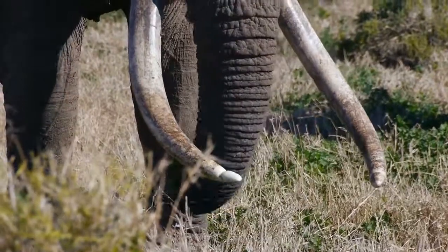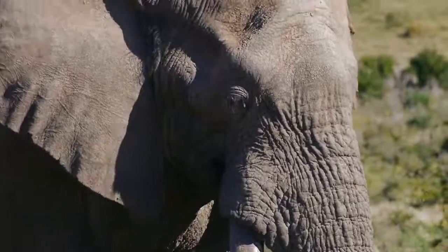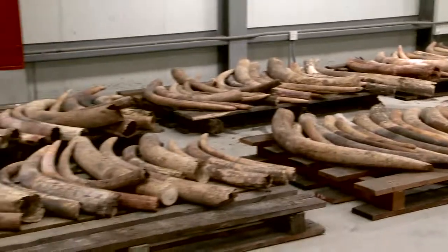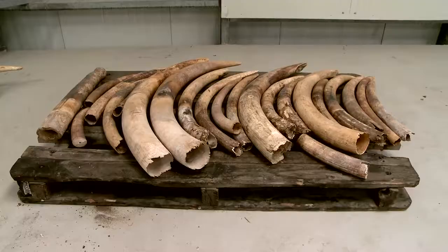However, to best achieve these goals, ivory seizures need to be properly sampled. This video demonstrates how to select and sample elephant ivory from large ivory seizures, and how to prepare and transport them to a laboratory for testing.